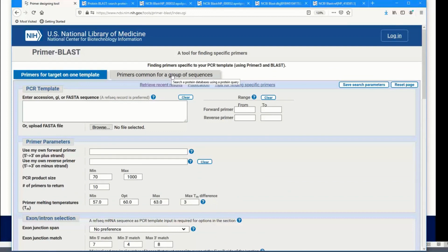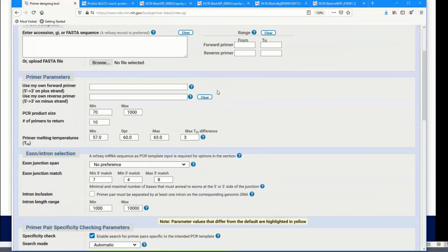Well, I think the defaults are probably your best option, and that's why they're set that way. What you're looking at essentially is a hybrid application. This top part here, these are the parameters of a program called Primer3, which is a public domain program that we've incorporated here. That's what designs the primers. So you can change your Tms and all that stuff, and that's the kind of thing you do for your PCR. These are optimal ones here.